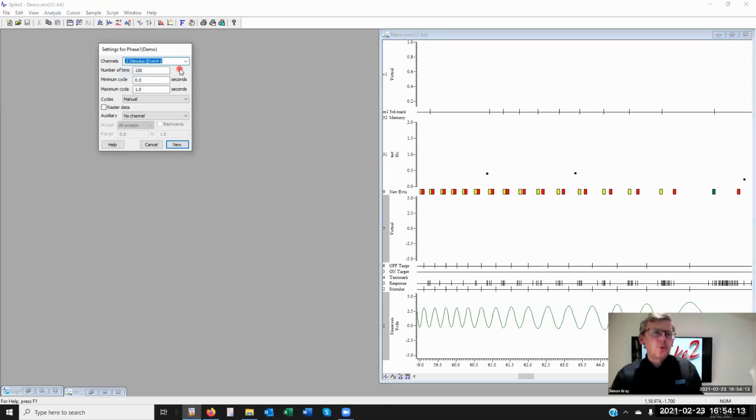Okay, now all of these result views follow the same process in terms of setting up. This is the channel I want to analyze. A lot of the time you have a trigger channel as well. What is the width of your result view? And that could be time, that could be frequency, etc. So the dialogues change slightly, but they should have pretty much a common feel.